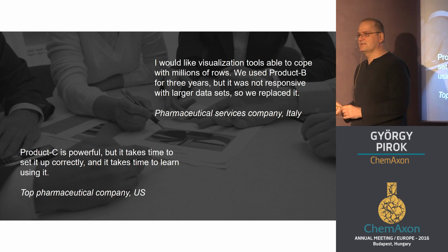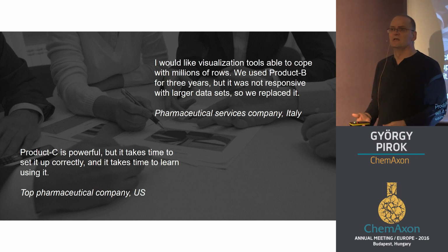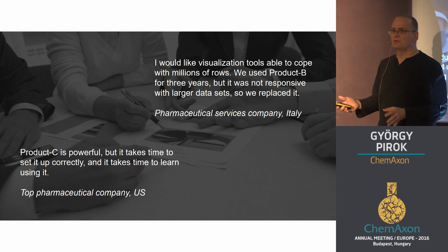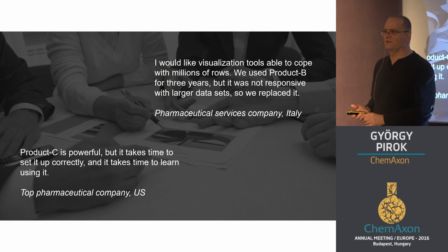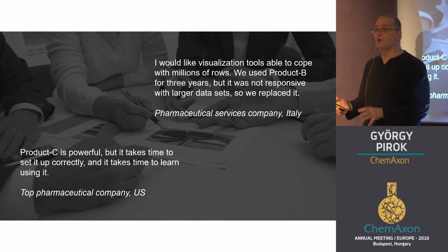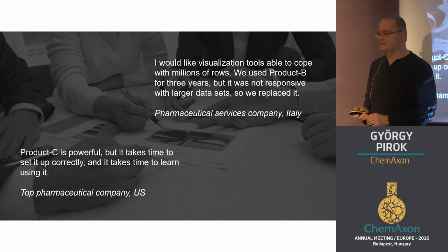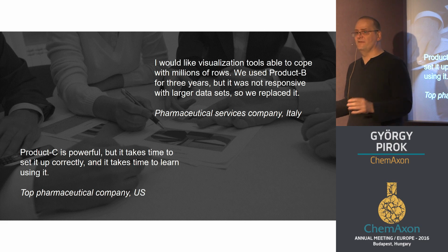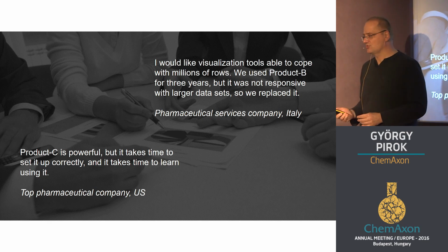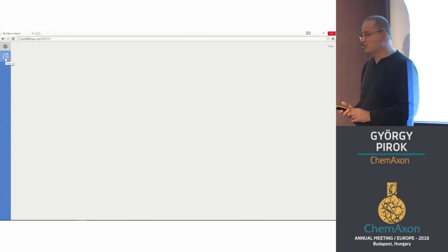And there was one software which was powerful but quite difficult to use, so it was more for the experts but couldn't be distributed among the scientists. So it was a challenge to consider this, but since this was quite a significant request, we designed Plexus Analysis as a system which, besides being able to handle a small number of points, is able to handle a large number of records, millions of records, and within a web environment where transferring data is a problem, it was a challenge. But we solved this, and here is the demonstration.